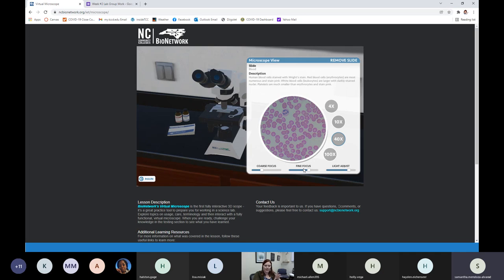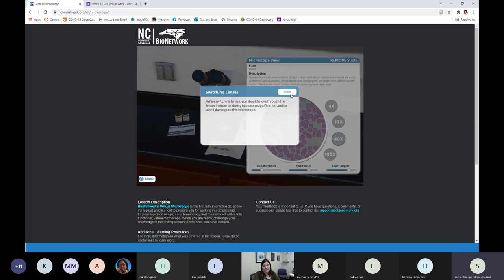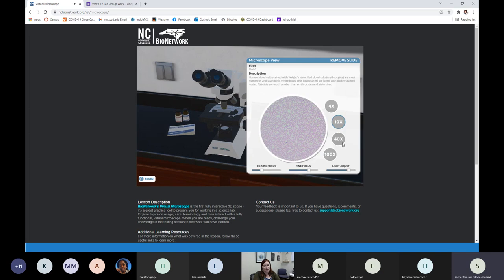If you can't get it to focus on the high power objective, go back to the low power objective and make sure it's in focus there. If you can't get it in focus on low power, go all the way back to the scanning objective. With par focal microscopes, if you didn't take the time to focus on the scanning objective, you won't be able to get it in focus on low power or high power. Make sure you can focus it at the beginning and that will carry you through as you work your way up.